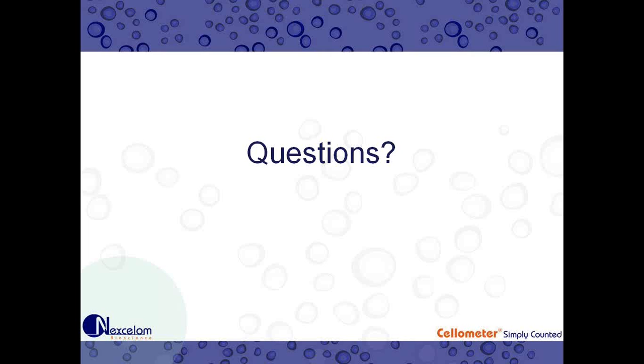So where would we use F1 minus F2 divided by F1 times 100? This is Dimitri, staff scientist here. A lot of these formulations really depend on the particular assay that you use and the fluorescent optics modules installed in your Cellometer.